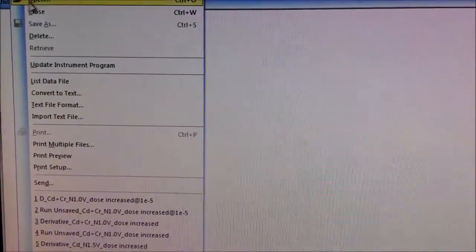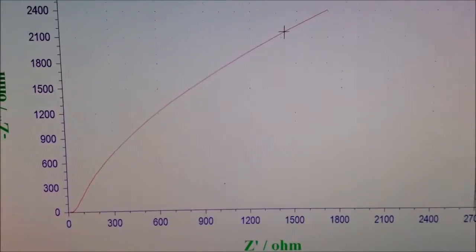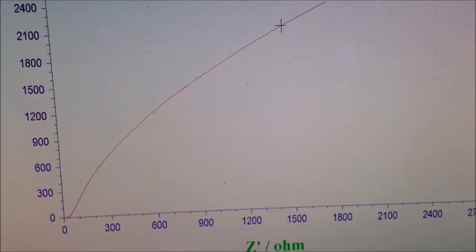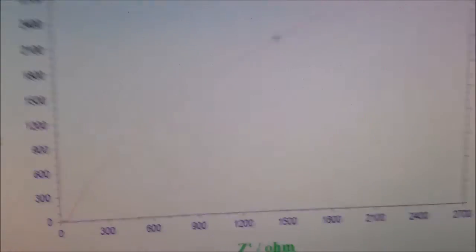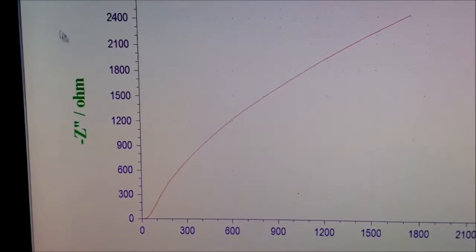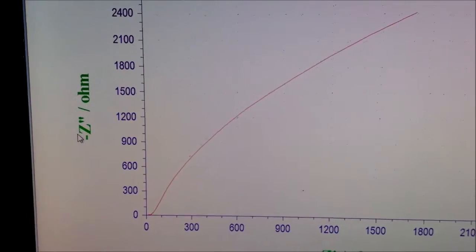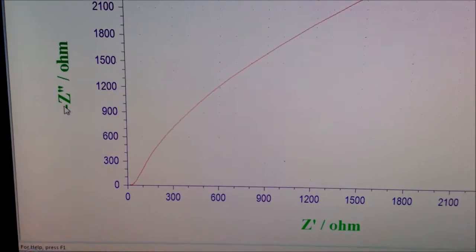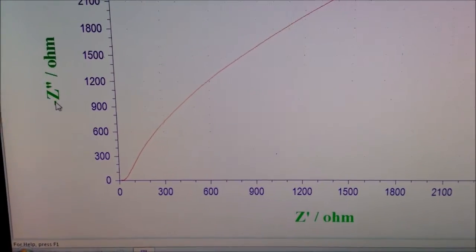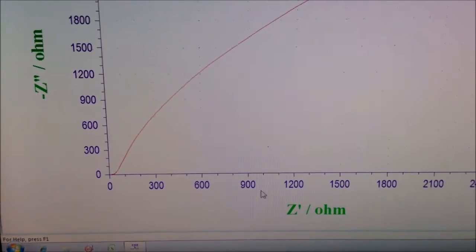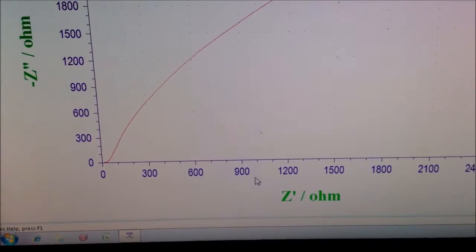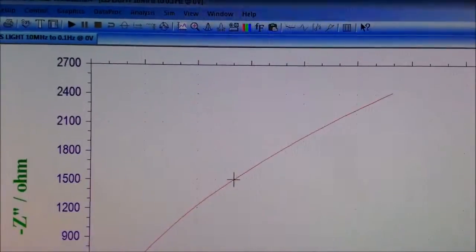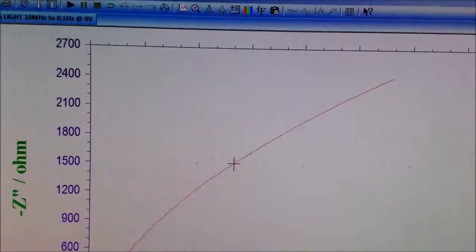Now let's browse the file. I have opened existing EIS data. You can see this is minus Z'' and this is Z' — this is the imaginary part of the impedance in negative and this is the real part of the impedance. Let's see how to simulate this curve.